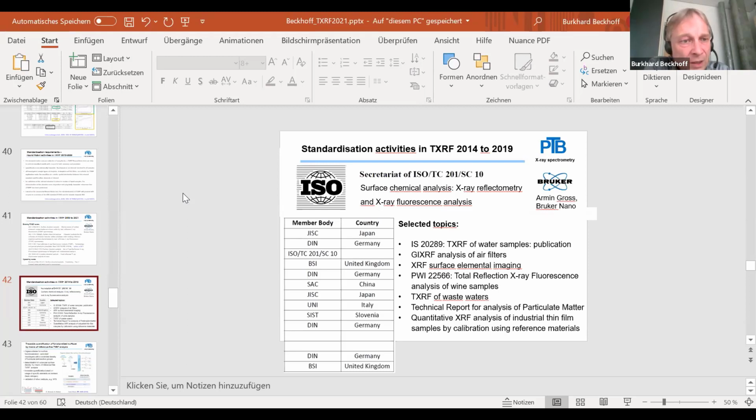And we will organize this, have a look in this publication that I mentioned. We started with a small number of participants to identify threshold values, and then we are extending this. And the international round robins, of course, are very valuable for WAMAS or ISO related activities. But here we were to update as a starting point a German regulation and then propose it on international level.